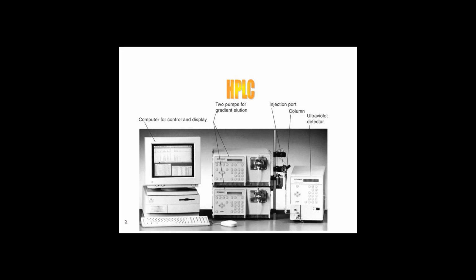In general, ion exchangers favor the binding of ions of higher charge and smaller radius. With respect to the functional groups in resins, an increase in counter-ion concentration reduces the retention time. A decrease in pH reduces the retention time in cation exchange, while an increase in pH reduces the retention time in anion exchange. By lowering the pH of the solvent in a cation exchange column, for instance, more hydrogen ions are available to compete for positions on the anionic stationary phase, thereby eluting weakly bound cations.